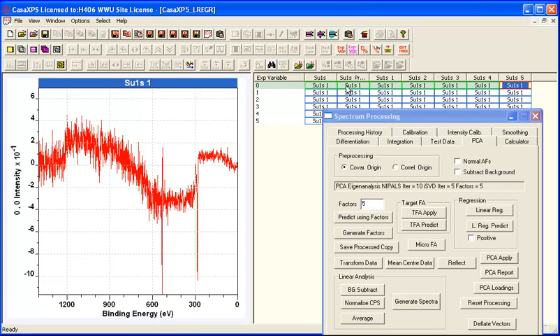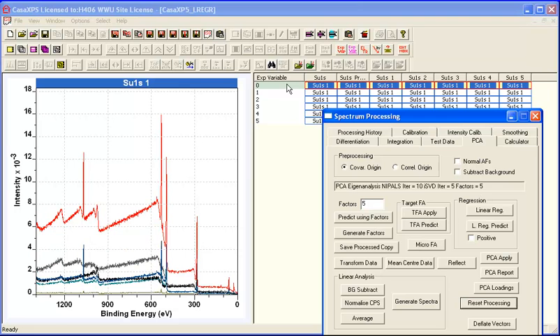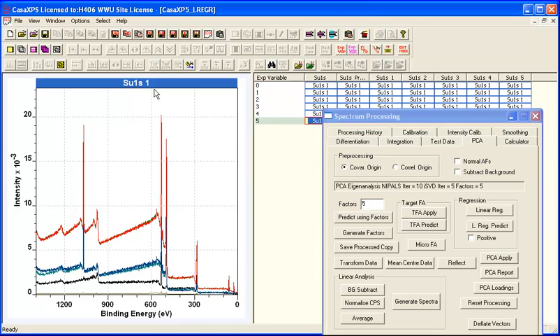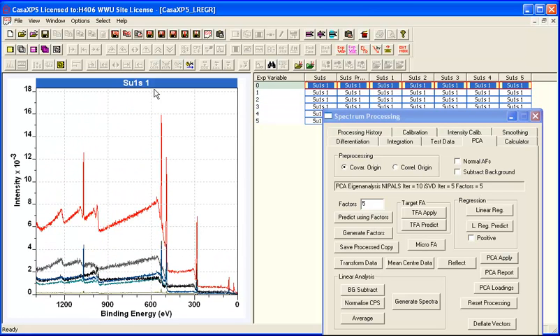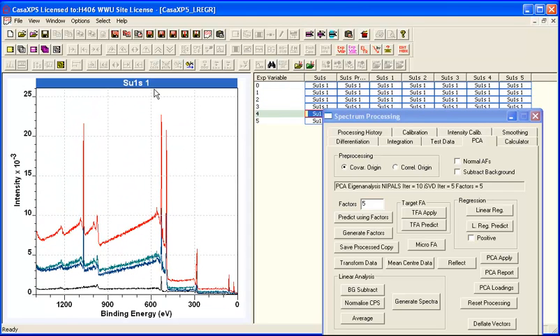So let's just put these back, and we now have a solution which we can now see that there are 2 significant shapes here that we ought to understand the chemistry of these and maybe a bit more.